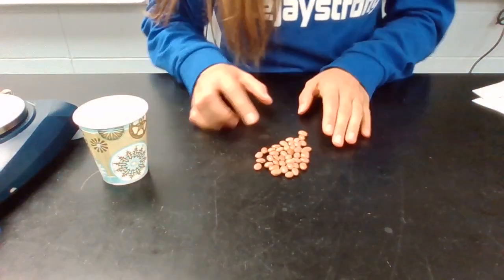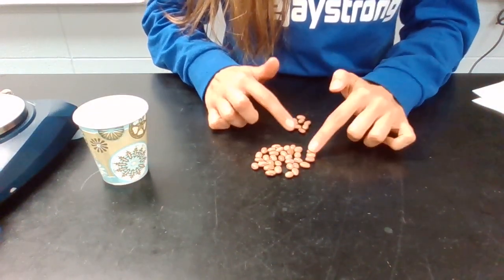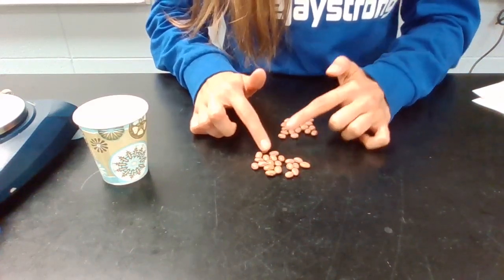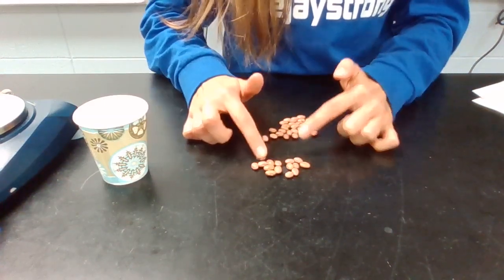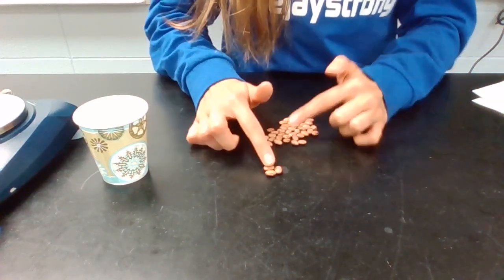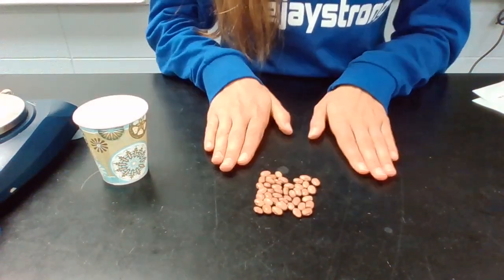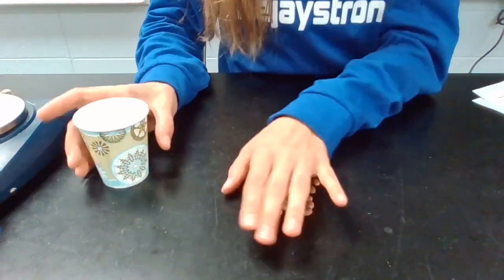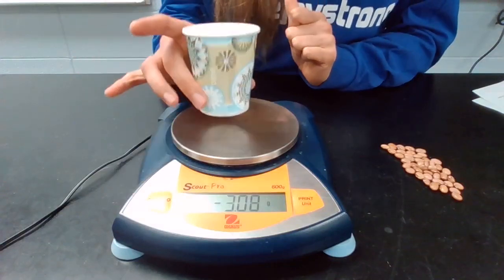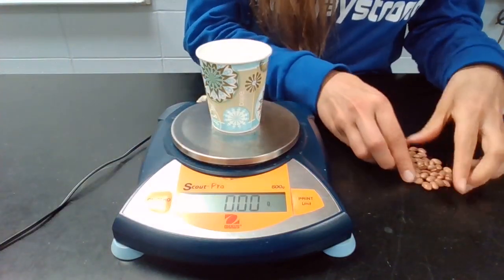This is my isotope B. I'm going to start by counting them. 43, we have 43 atoms of isotope B, so make sure you write that down. And then we are going to put these onto my balance. Let me put my Dixie cup on. It's zeroed, so it is good to go.